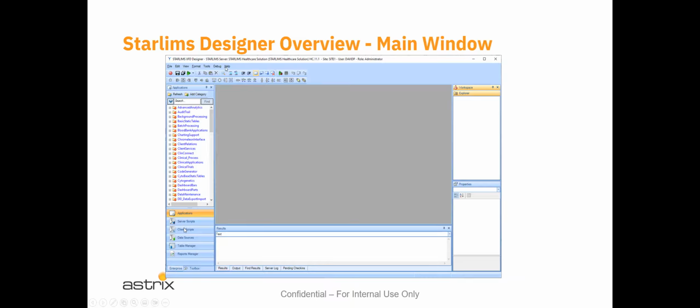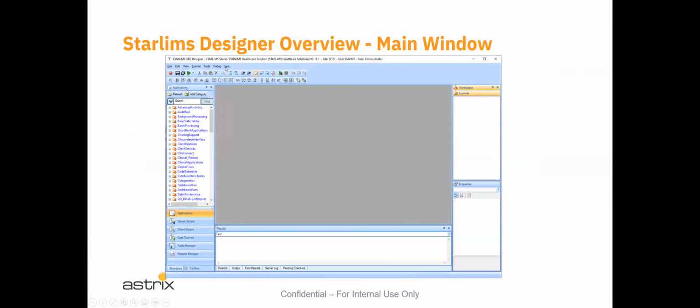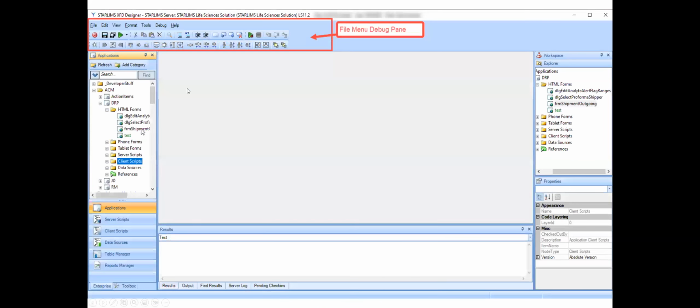As you open these categories on the left-hand side, you will have additional options presented on the right-hand side over here. Here, I blew it up a little bit for you. Under the applications category, in the previous pane I expanded it out. I have some stuff here that shows some categorizations and groupings for the specific types of objects that occur within the category. This is developer stuff, obviously. With my initials, I created a category for myself, and beneath that is an application, actually. DRP is called an application.